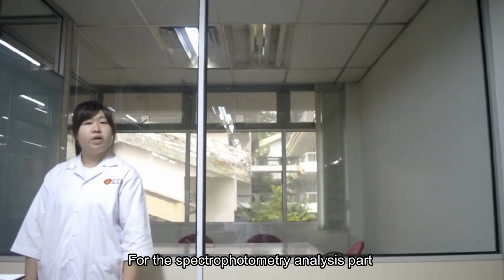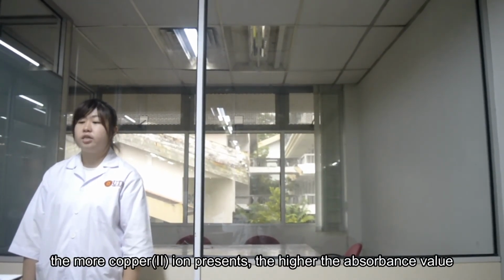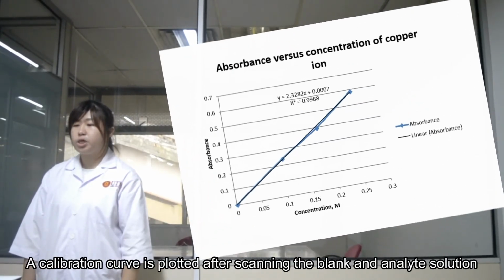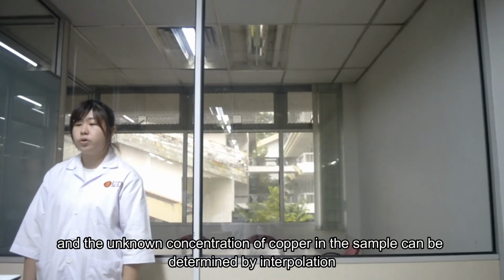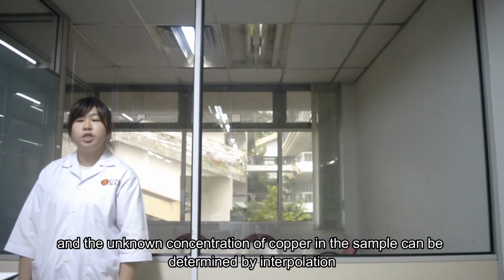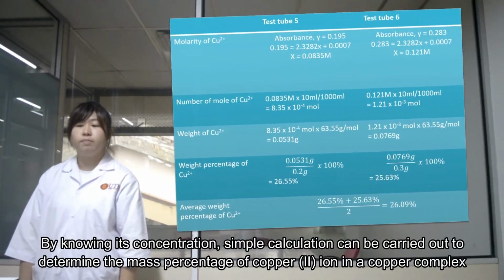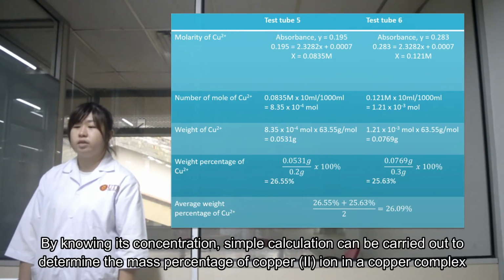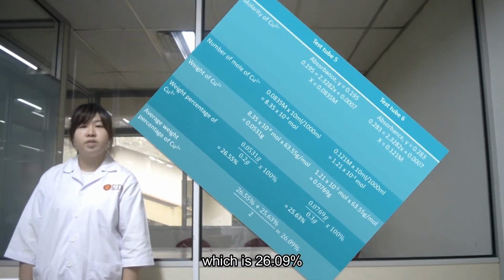For the spectrophotometric analysis part, the more copper-2 ion present, the higher the absorbance value. A calibration curve is plotted after scanning the blank and analyte solution, and the unknown concentration of copper in the sample can be determined by interpolation. By knowing its concentration, simple calculation can be carried out to determine the mass percentage of copper-2 ion in the copper complex, which is 26.09%.